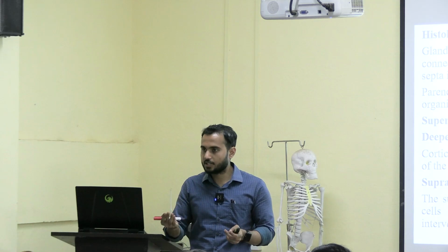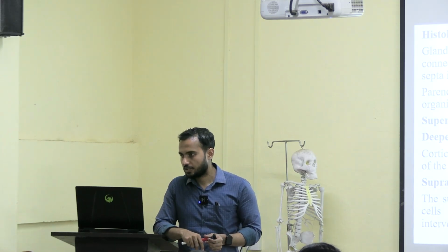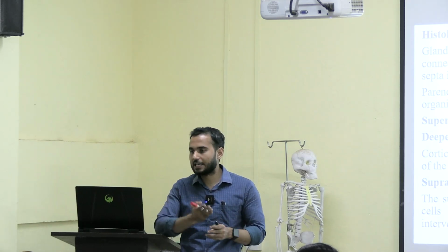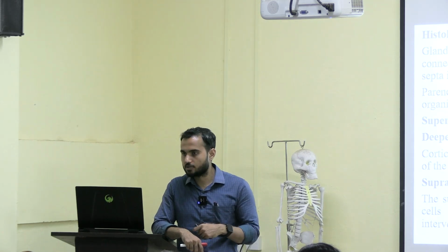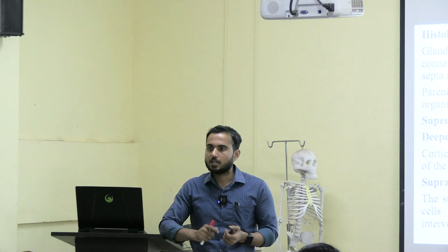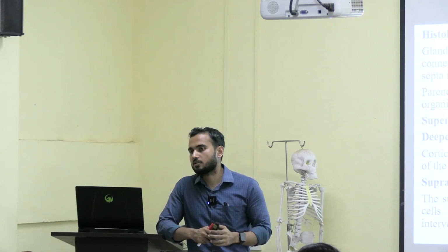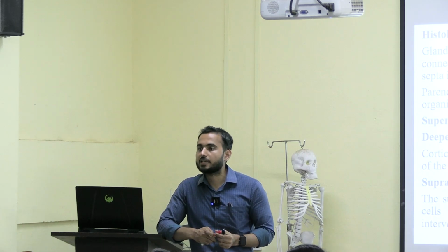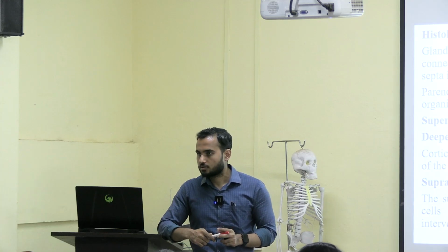Whatever you can see, there also you will be able to see cortex and medulla. Similarly in suprarenal gland also, suppose you have taken the suprarenal gland, you have taken an LS. After that, what will be visible inside? You will be able to see cortex and medulla. Now in case of suprarenal gland, cortex is occupying 90% of the gland. Medulla is occupying only 10%. That means medulla is smaller, thinner as compared to the cortex.